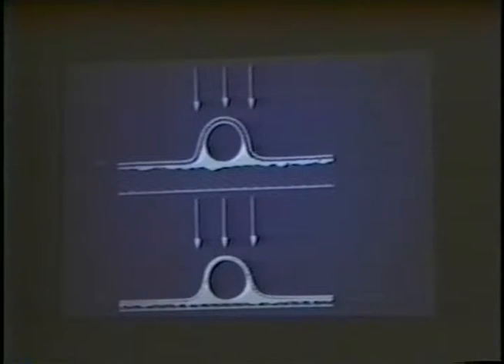If there is a double layer of carbon with molecules and stain sandwiched between the carbon films, there may be even negative staining, but at the same time a greater amount of molecular compression. This is depicted diagrammatically on the next slide.